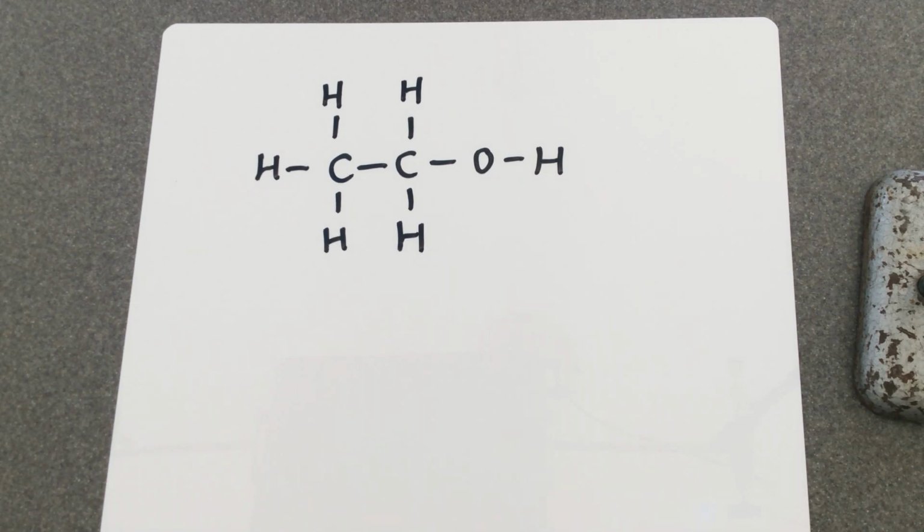The purpose of this video is to introduce you to mass spectrometry. The good news is that you don't really need to know how mass spectrometry works. However, I'm going to give you a really simple and very brief introduction. What happens inside a mass spectrometer is you vaporise your sample.